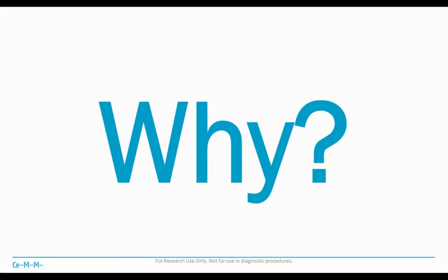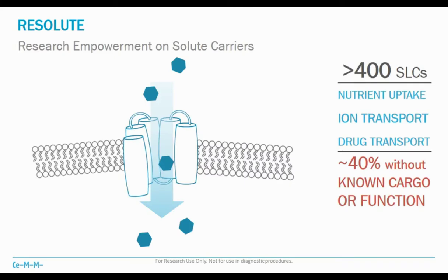And there is one particular project I would like to point out where it's really essential to have this wide range metabolite analysis provided with one robust system and instrument. And this project is RESOLUTE. It stands for Research Empowerment on Solute Carriers. This project is funded by a grant from the Innovative Medicines Initiative, and it focuses on a particular protein class called solute carriers, or SLCs in short.